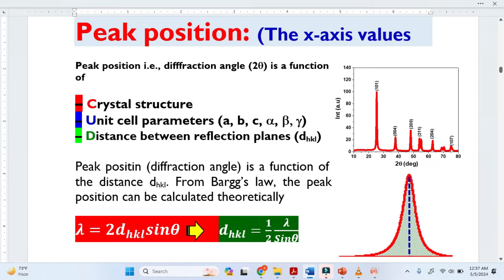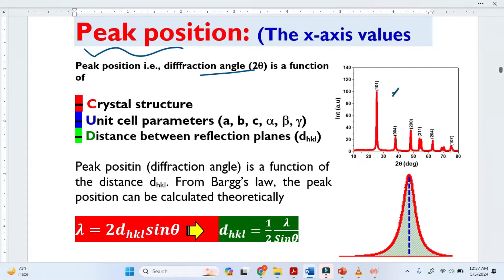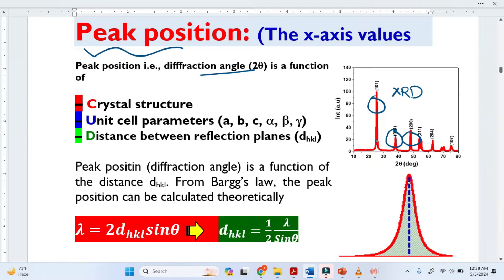Peak position means the diffraction angle. This is the XRD pattern and the peak position means the vertical line — just draw a vertical line from the peak down to the x-axis. The x-axis is basically the 2θ (2-theta), and these are the peak positions.